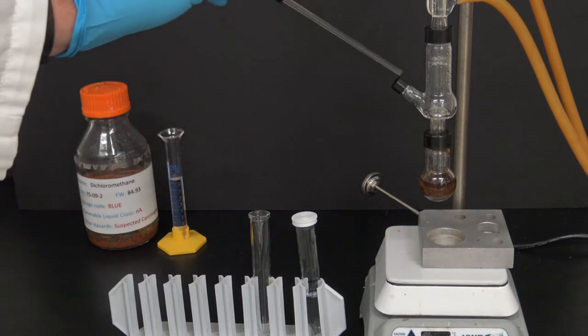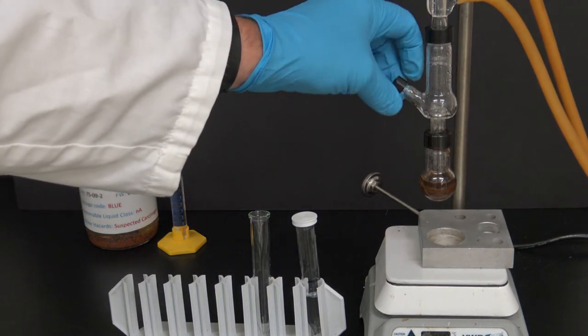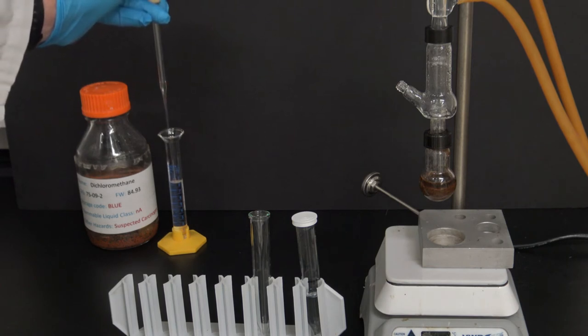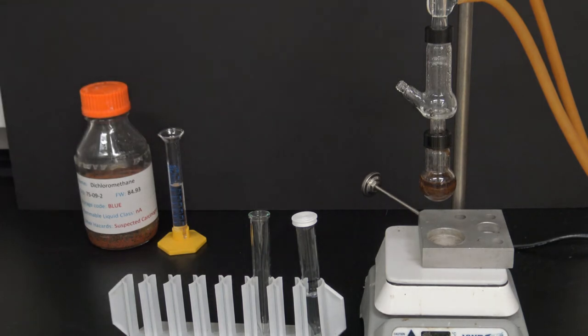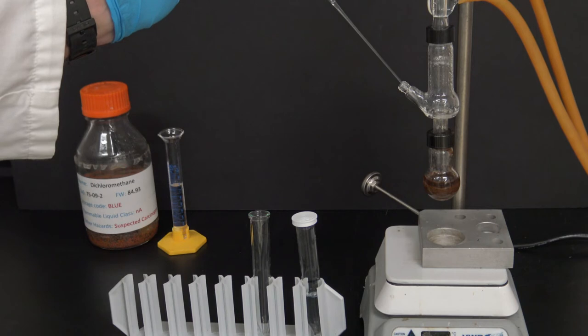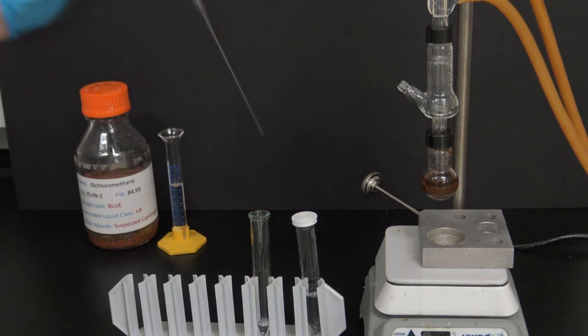Now I'm going to actually put some of that methylene chloride into my Hickman still just to extract any more essential oils that might still be down in there. So I'm going to remove the sidearm cap. I'm going to take approximately 1 milliliter of the methylene chloride, and I'm going to put it down in there, into the Hickman still. It's going to solvate any essential oils that might be in there. And then I'm going to remove those and put them in my second conical test tube. And put that in there.